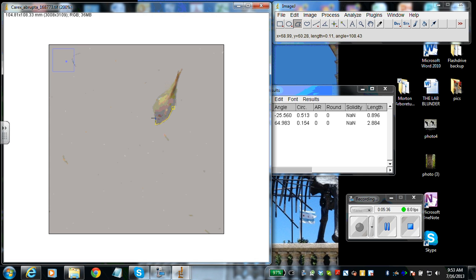Try to keep it as close as I can to the shape of the perigynia. So I'm just clicking away as I'm going around here. If it seems like there's a little chunk taken out of the perigynia for some reason, then you could probably fill that gap and make it an approximation to what you think the shape should look like, following the trend. If in doubt, take a screenshot of it. We can send it out to our specialists and they can answer that question for you.